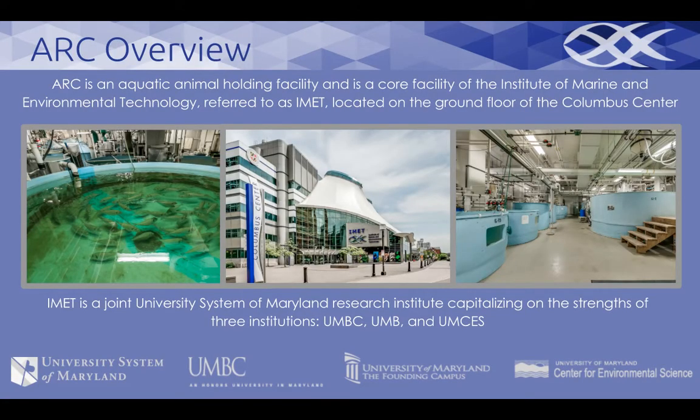ARC is the aquatic animal holding facility for the Institute of Marine and Environmental Technology, referred to as IMET, located on the ground floor of the Columbus Center building. IMET is a joint University System of Maryland research institute capitalizing on the strengths of the University of Maryland Center for Environmental Science, the University of Maryland Baltimore County, and the University of Maryland Baltimore. IMET utilizes the research, training, and technology transfer capabilities of these partner institutes to further its mission. Aquaculture is a key component of IMET's research and mission.